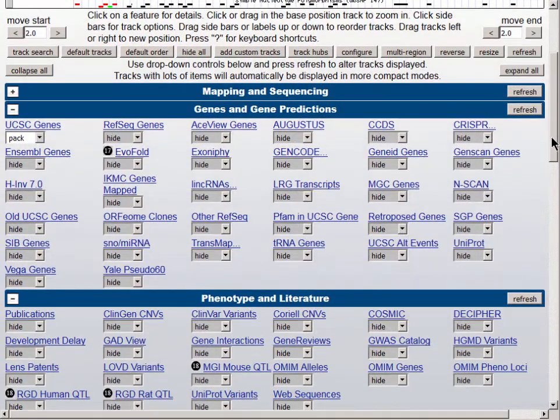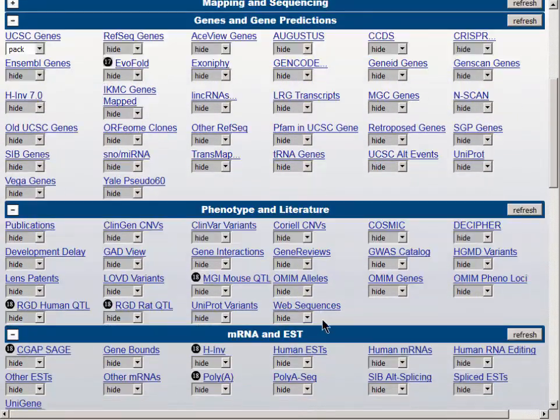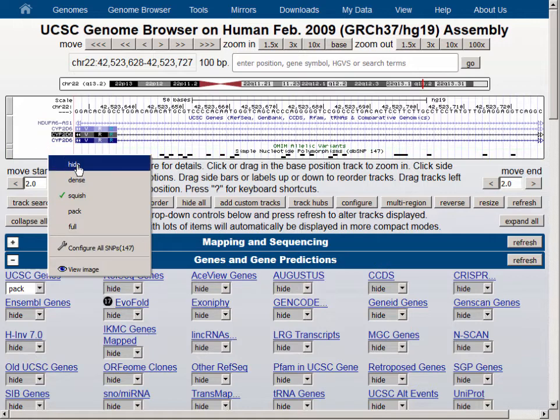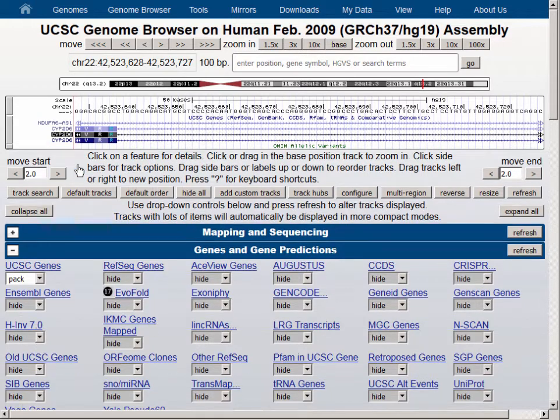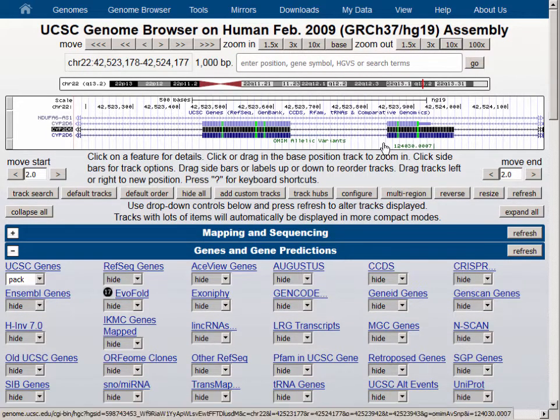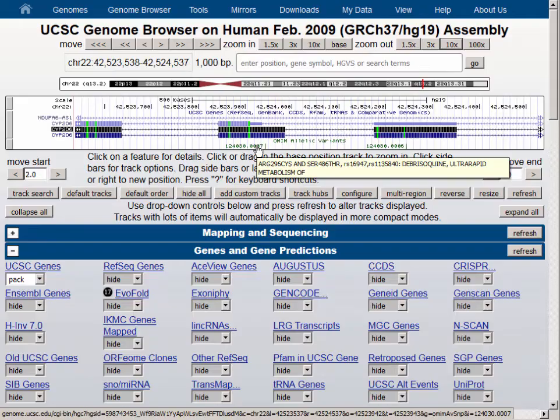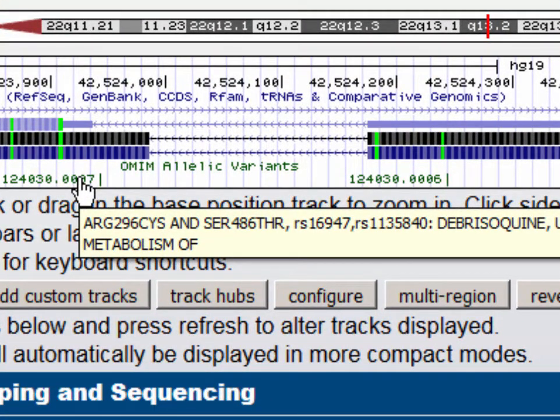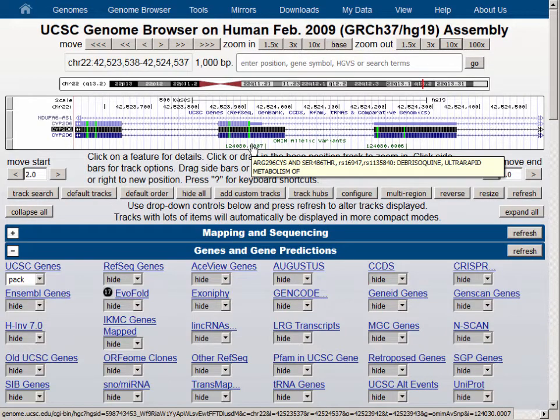For some SNP tracks, however, it is useful to have the labels shown, and one such track is the OMIM alleles track. Let's put the SNP track into hide and move out by a factor of 10. The OMIM allelic variants gives us a display where it's possible to use the mouseover feature of the browser to get individual information about the variant — in this case, that it's an arginine to cysteine at amino acid 296, with an RS number and a specific disease state associated with it, specifically diprisoquine ultra-rapid metabolism.